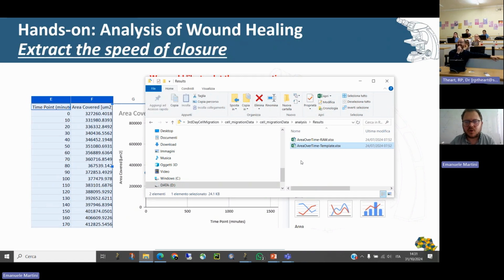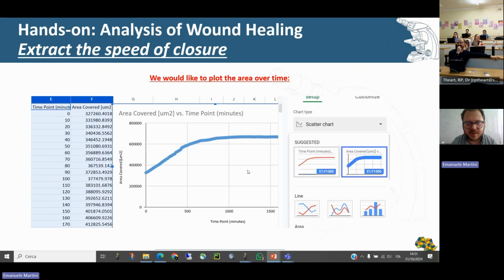Okay. So let me know if you have reached something like this. It's not really important that everybody does everything. It's just to follow at least what we are doing. Of course, if you can follow everything is better. If you can write everything is even better, but everything is on the slide. It's more important to understand what's going on.